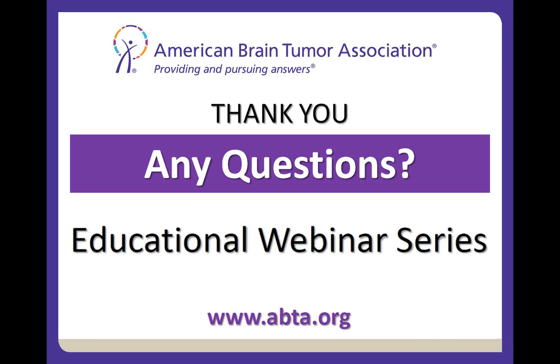And really the only thing that would limit it, and there are cases, for example, if I have a really minute piece of tissue, if I've only got a couple of millimeters worth of tissue, I'll even call the neurosurgeon and say, and they don't usually like to hear this, but I'll say, look, this is a really small piece of biopsy.